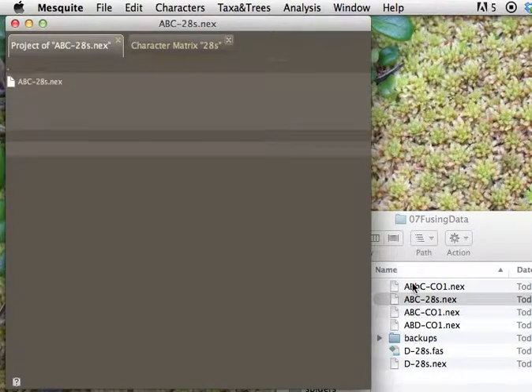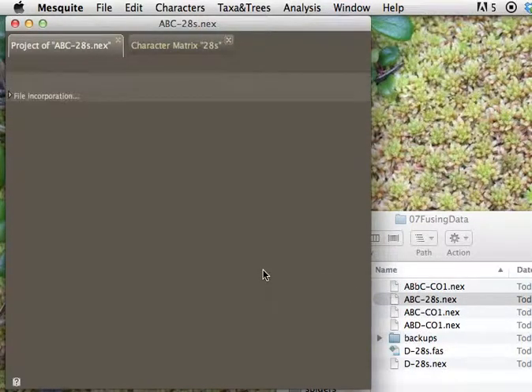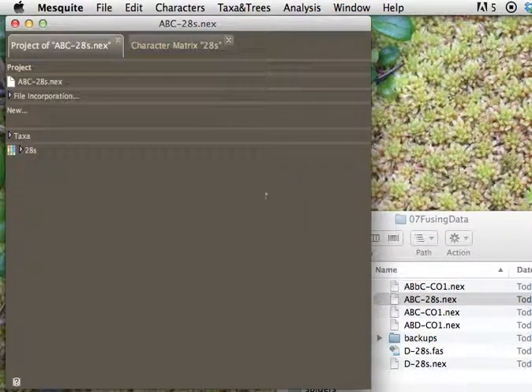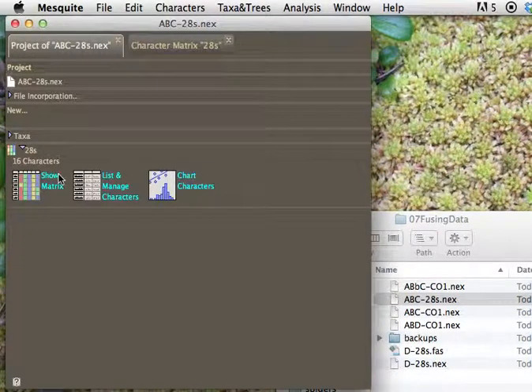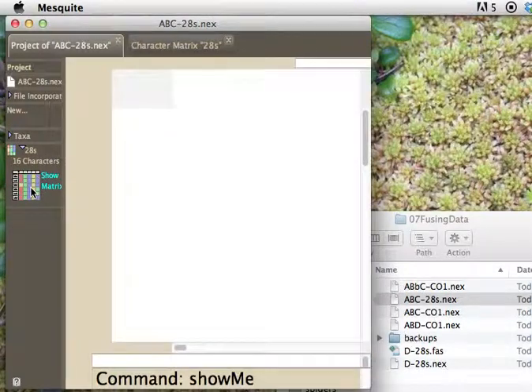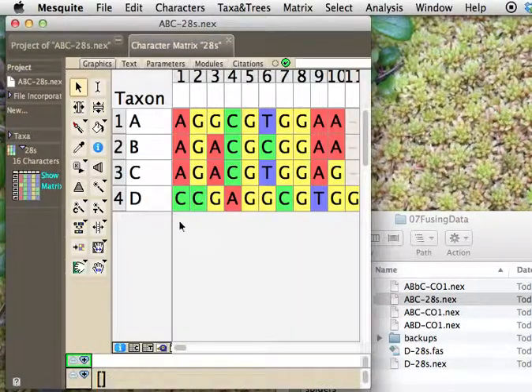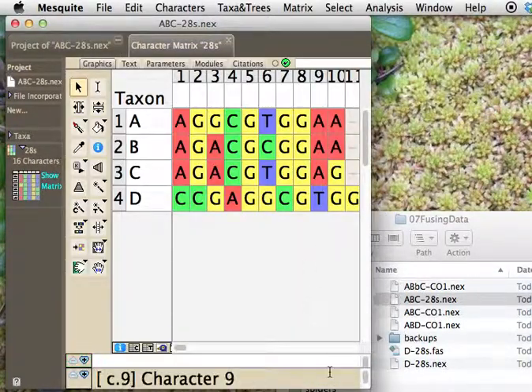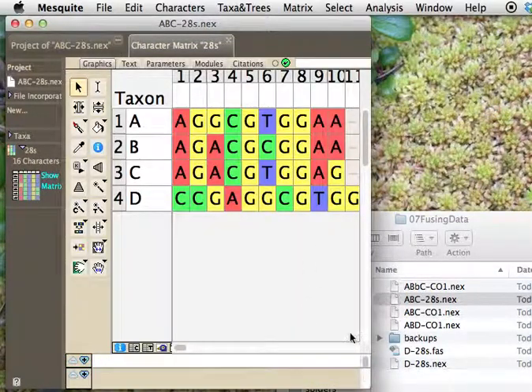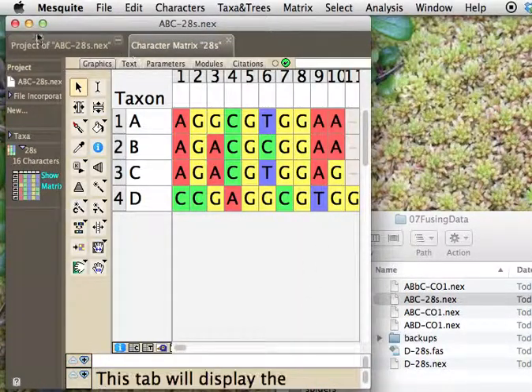In another example, we're not going to do it that way. And here we have it, and we look, and we can look to see what's happened, and indeed, it's gotten fused in. So that's another way to do it.